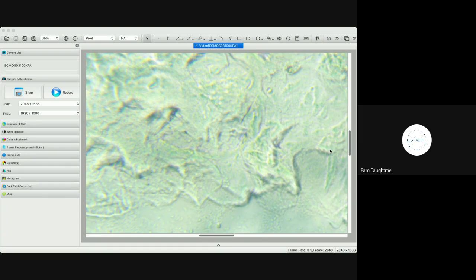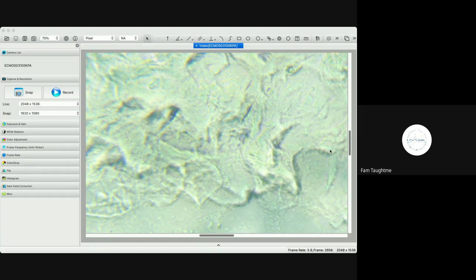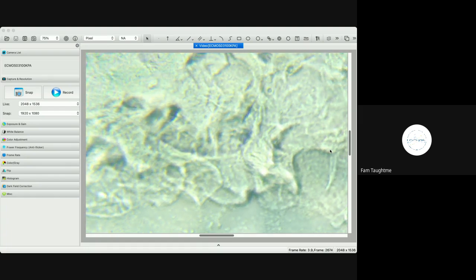Typically, cervical mucus is described as egg white and stretchy. Is that the mucin network? Yes, it can be. I also believe it is potentially a mixture of S and P fluids. The literature says that the mucin network is going to open, like the size of the pores are going to open or close depending on the cycle phase.